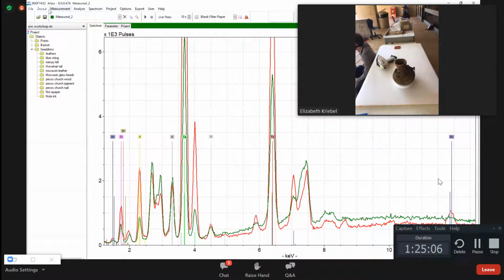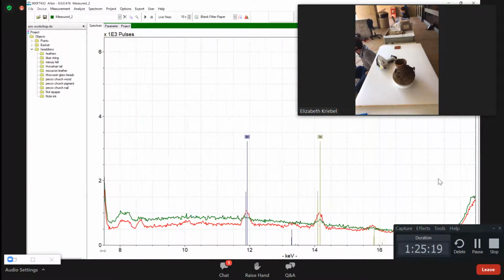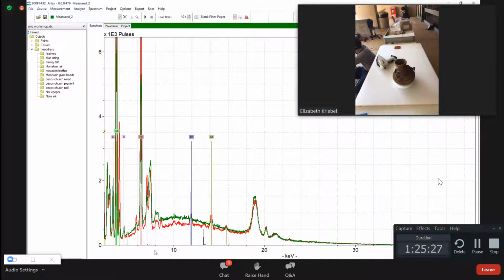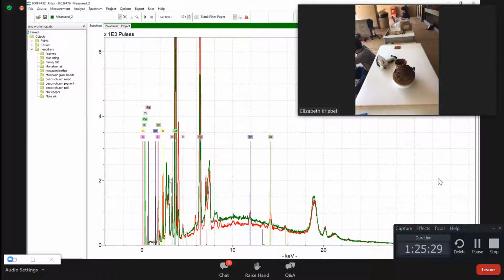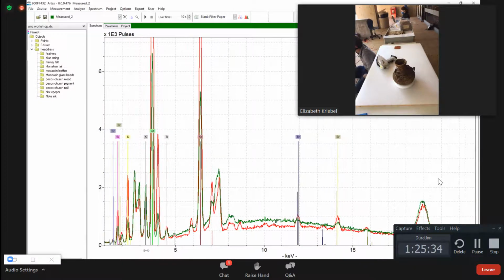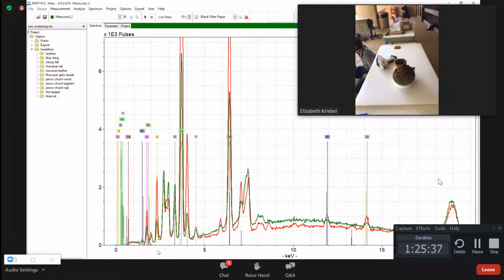All right. So the good news is I can see what this stuff is. First off, no bromine in that. So that's interesting. Man, there's not a lot. There's no obvious peak in that new spectrum that's higher. It's organic, whatever it is. That makes sense. It's really organic, honestly. It's like tree sap or something, but it doesn't have a clear inorganic elemental signature.